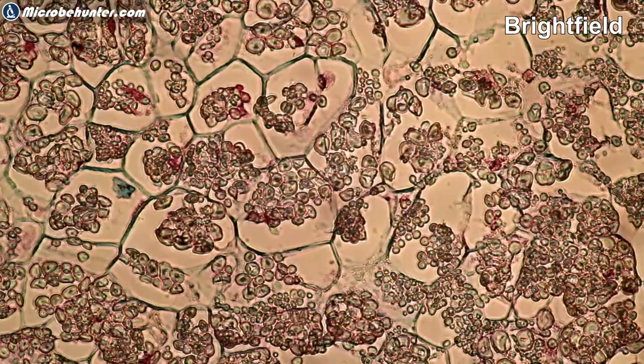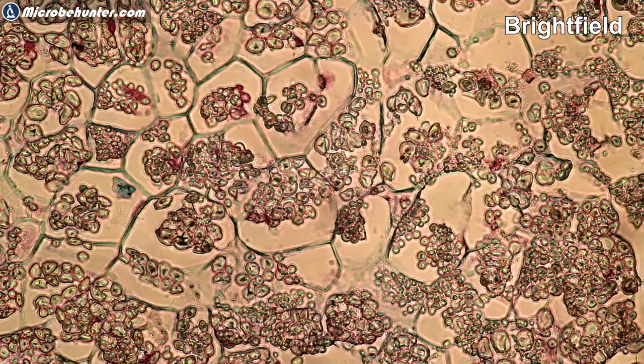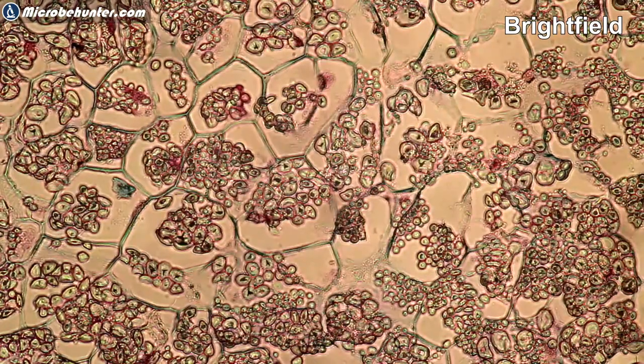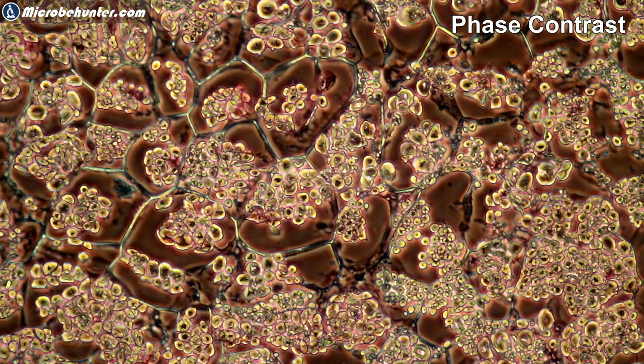A permanent slide. These are the starch grains of a wheat grain. So this is a commercial permanent slide. And in phase contrast, looks much nicer.